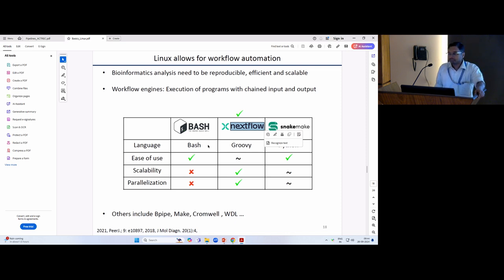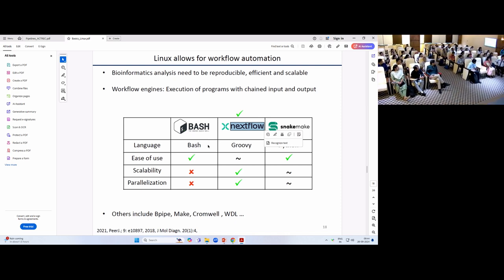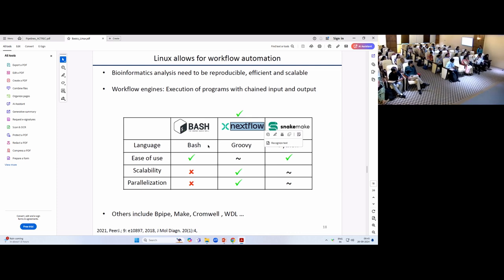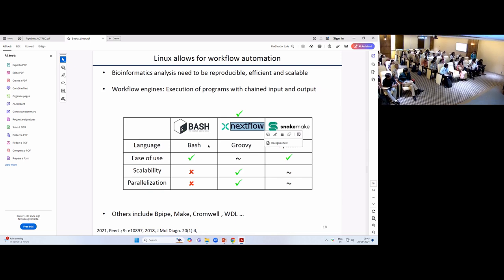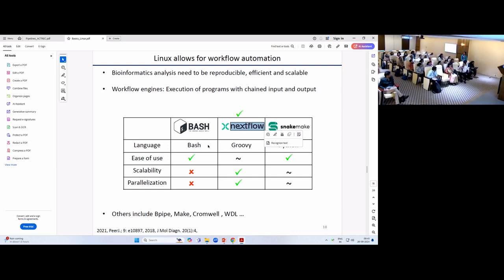Nextflow will take all the samples together at once, and to the best of my knowledge, run everything in parallel. So everything undergoes BWA, everything undergoes SAM tools, and goes step by step. Let us say the light went. Okay, real life scenario. Server light went, backup went, everything went to hell. Armageddon.